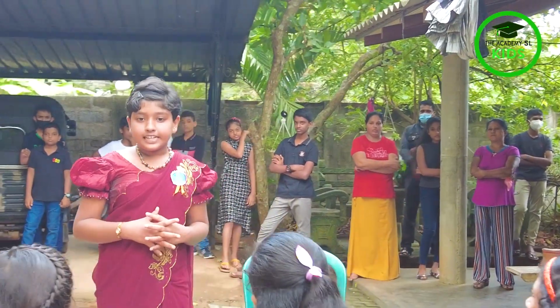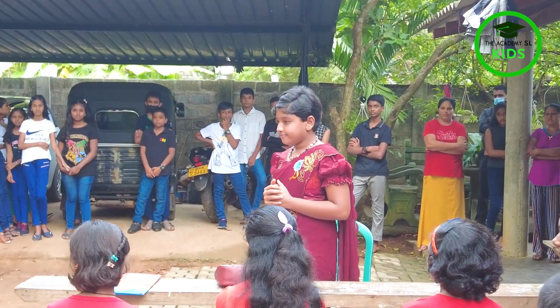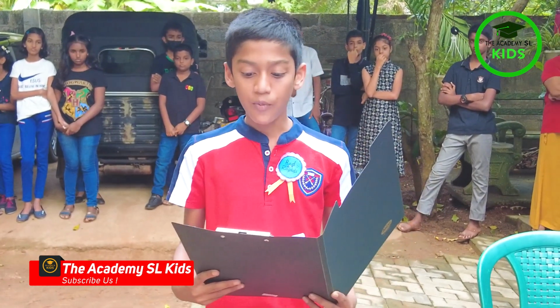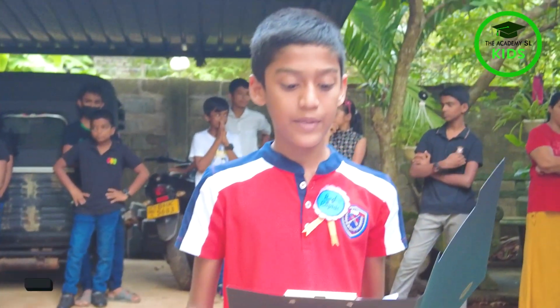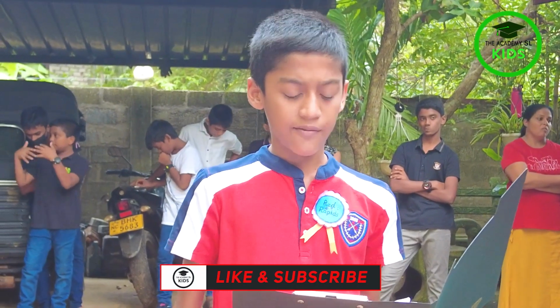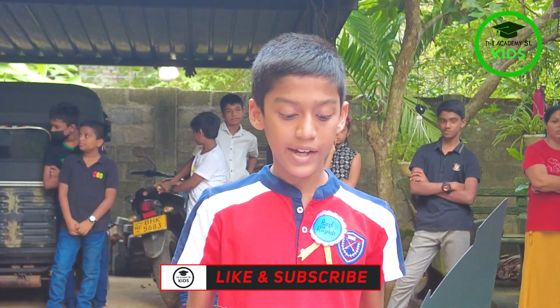Did you do the other assignment I told you to last week? These are the precautions to consider in the use of microscopes. When the microscope is carried from one place to another, the arm of the microscope should be held by one hand and the other hand should be kept below the base of the microscope. Then hold the microscope toward your body. Wipe the stage using a clean piece of cotton after use.